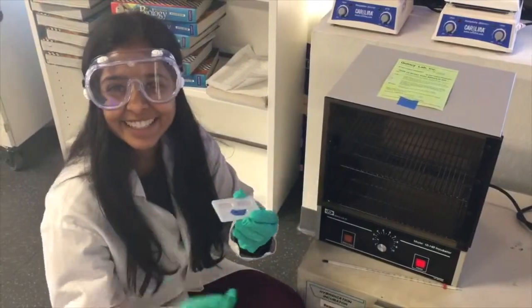It worked! So just to recap what we learned about the indirect ELISA assay technique today. The ELISA technique is used to test for antibodies. The technique involves the use of a microtiter plate, which has multiple wells. The antigen solution is added to the wells and incubated so the antigens can adhere to the plate. The wells are then washed with PBS buffer, which removes excess antigens.